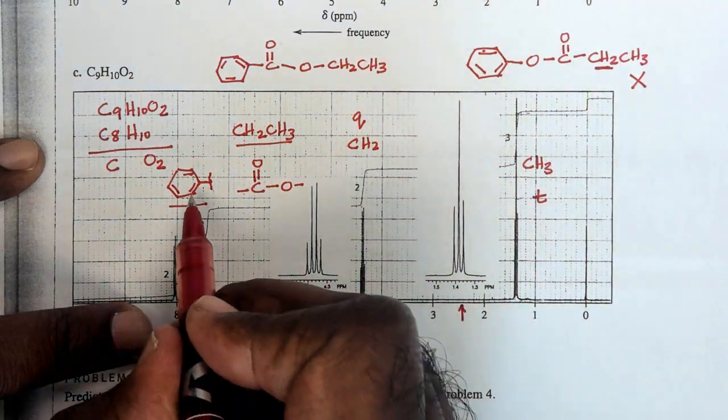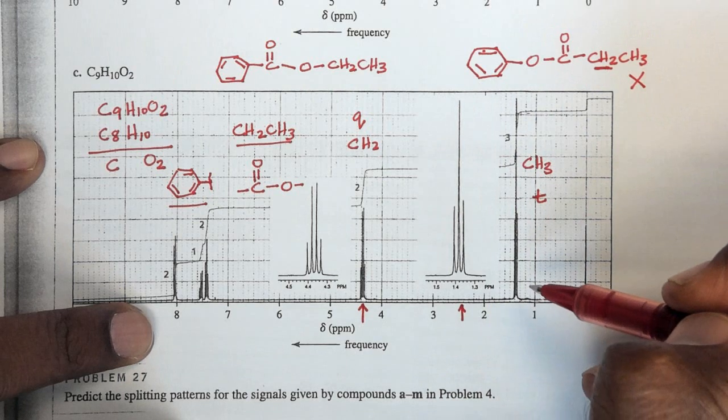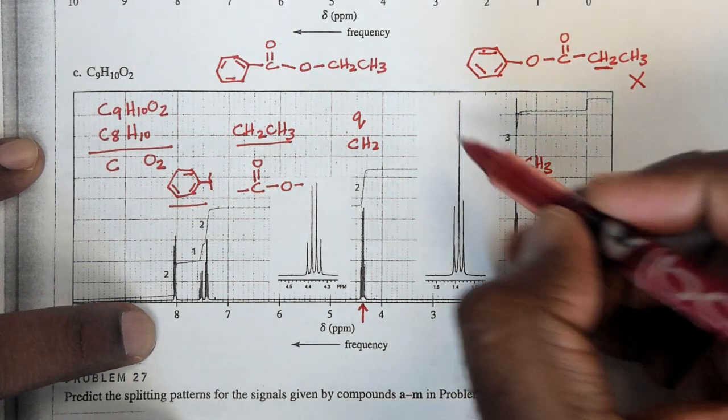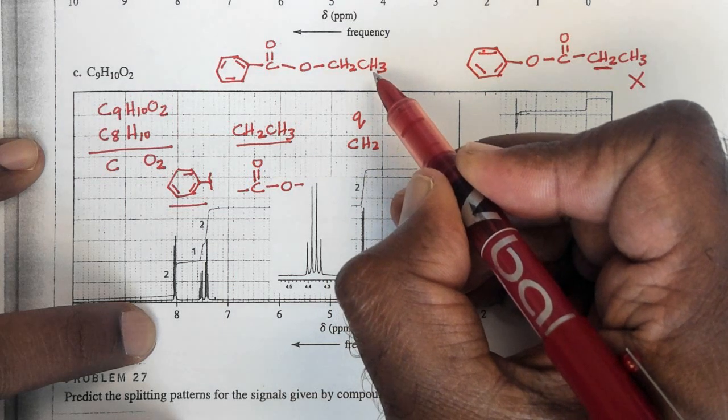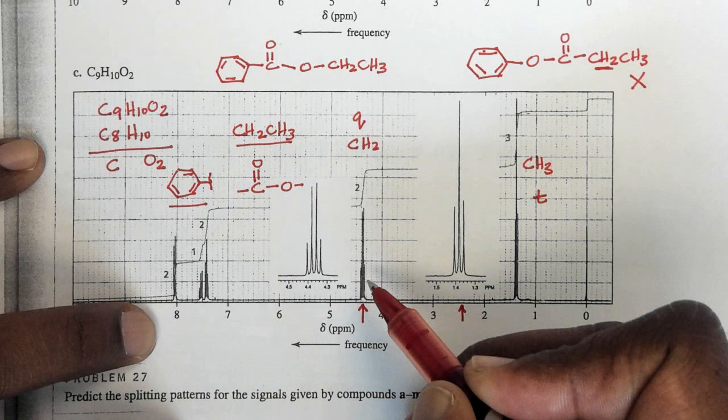So you can't just have your fragments and put them together. Once you get the structure, you need to go back and see if it makes sense. And this example is very good for you to see that this structure makes more chemical sense because of the chemical shift of this CH2 peak.